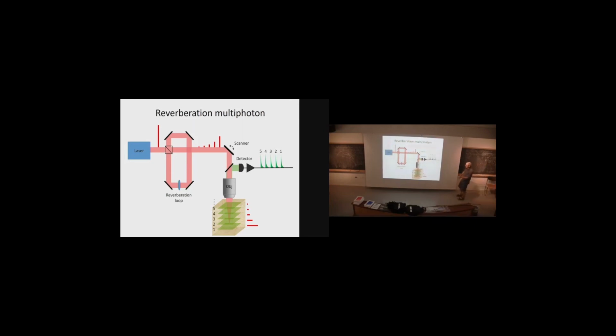And I can adjust the separation between two planes, which I can do just using the lens here, such that with this decay law, 1/2, 1/4, 1/8, I get basically the same fluorescence from each plane. So what's the optimal separation? The optimal separation depends on the scattering length times log 2. The scattering length in brain is maybe 100, a couple hundred microns, multiplied by log 2. So the delta Z is about 100 microns.